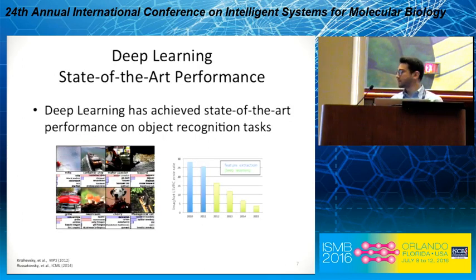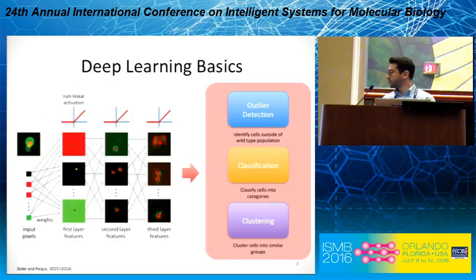Around the time I started, deep learning became really popular. Since 2012, with the first GPU-based implementation, deep learning algorithms have pretty much taken over any challenge related to object recognition in images. They've also been really good at speech recognition and other tasks as well. And the primary benefit of deep learning, in my opinion, for these data sets is that they're trained on the raw data, and they're trained specifically for the task that you're working on. So the features you end up building your classifier on are tuned toward the data set you have, and they're also tuned toward the classification task that you're working with.